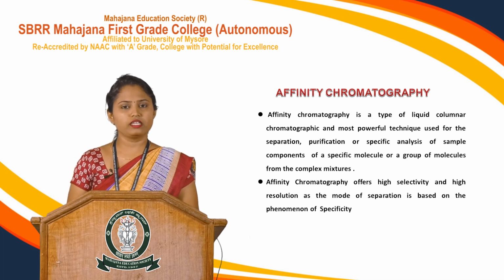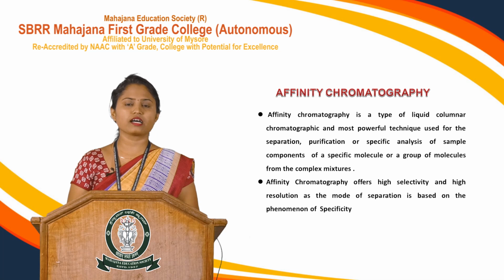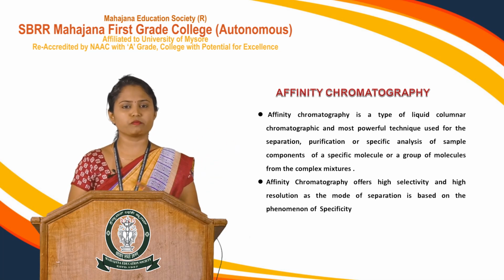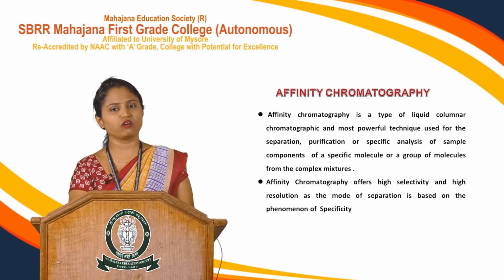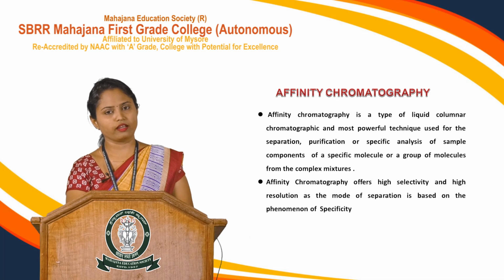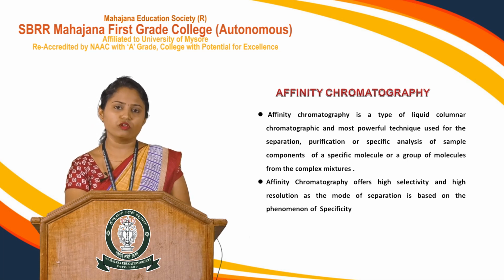As the term indicates, affinity is a kind of attraction or binding affinity towards specific molecules. This affinity chromatography is one of the types of columnar chromatographic technique where the mobile phase will be liquid.